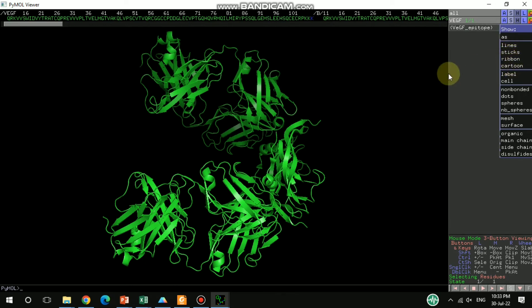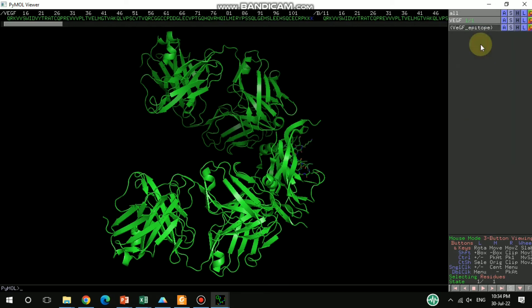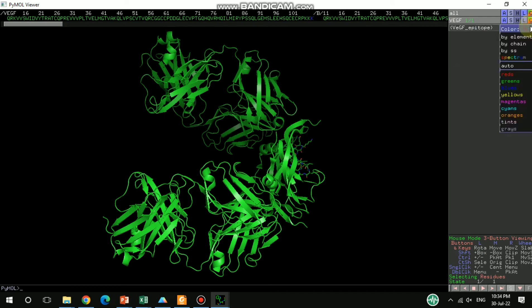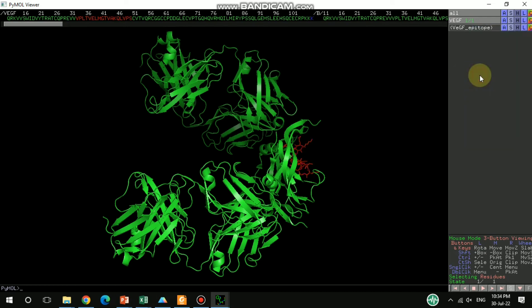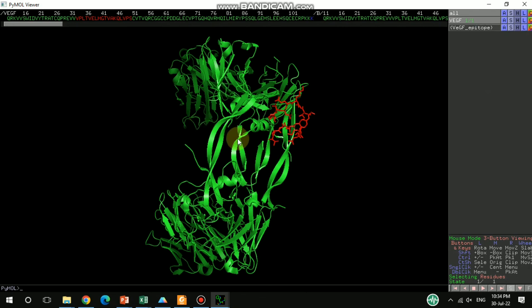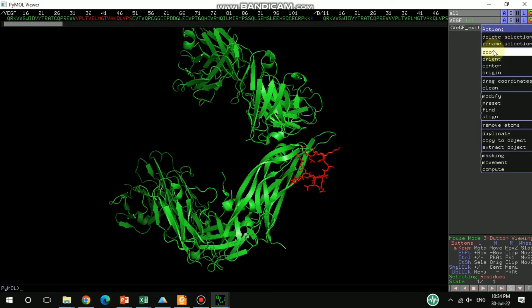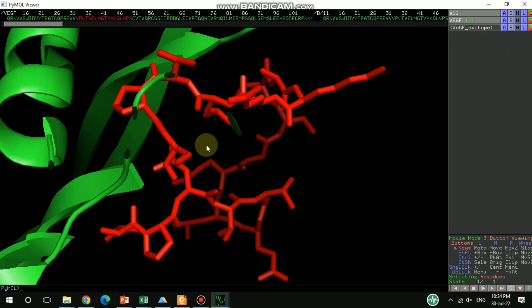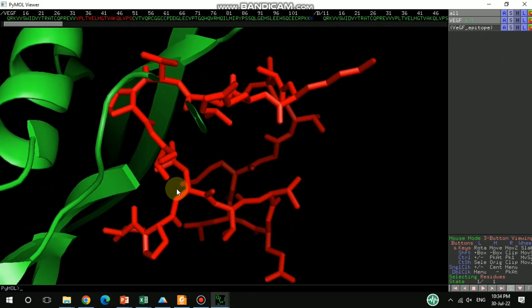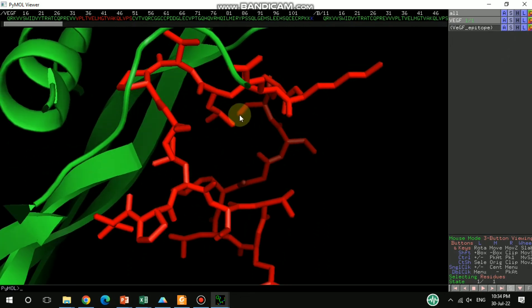This is already in cartoon representation, so you can choose to show it as sticks, and you can also change the color to red. Now see — this red sequence is the epitope. You can see it here. You can zoom in and then you can understand more clearly. This is the right sequence of that epitope of that antigen.